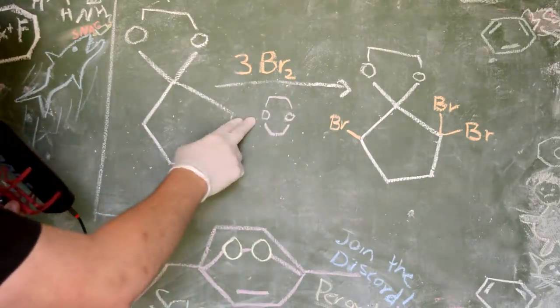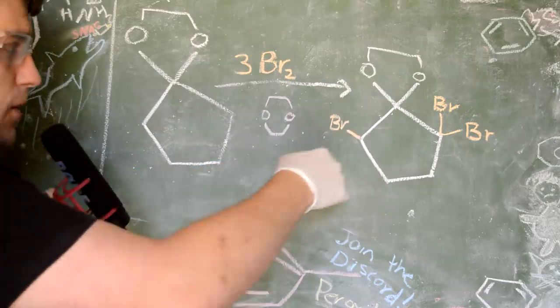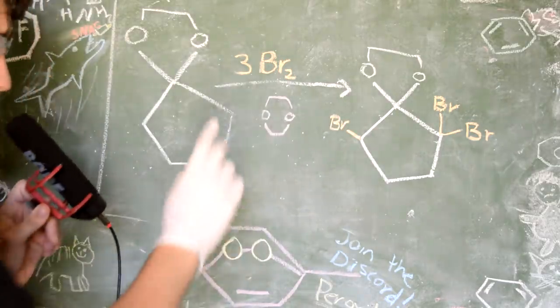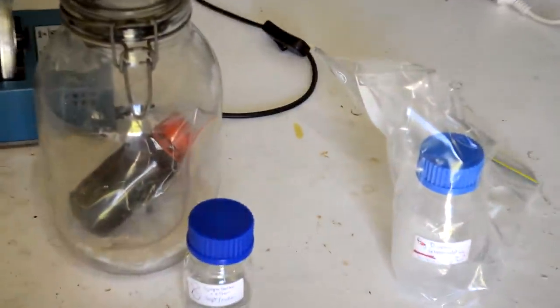They speculate that this is a thing that gets brominated, so you actually turn the dioxane into dibromine dioxane or something like that, and then that species then brominates the ketal. However, they do drop another key bit of information, because if we scan down and have a look at our reagents, go down here. First of all, look how nice they are.